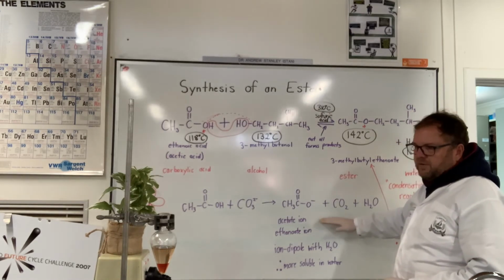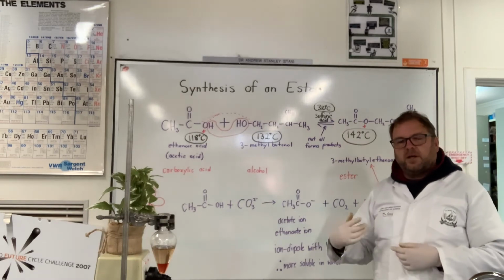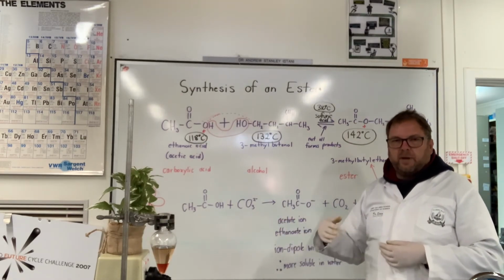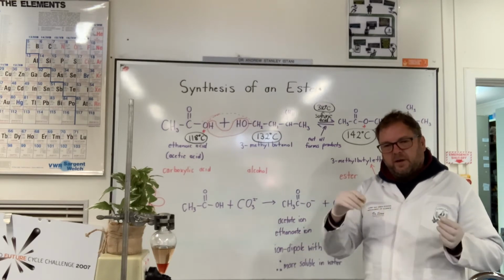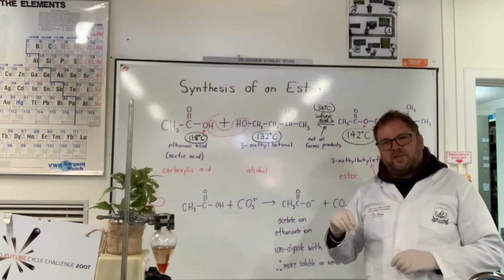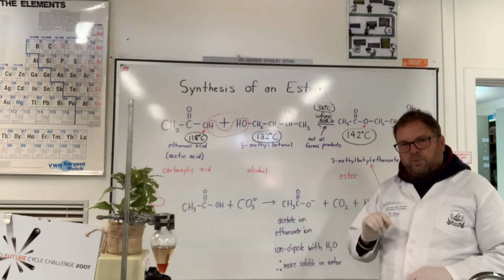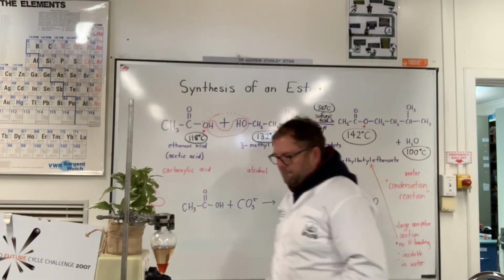It's a solvent extraction type technique, so it's similar to what we did with getting the bromine out of the bromine water into the cyclohexane when we did the test for alkenes in one of the previous videos. So I'll pause and get set up to do that.